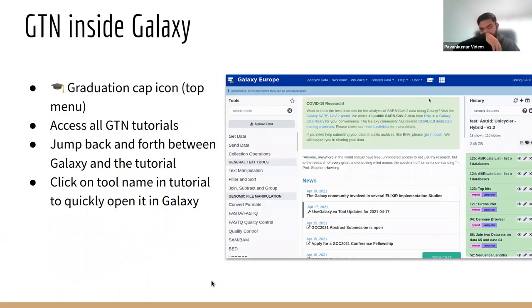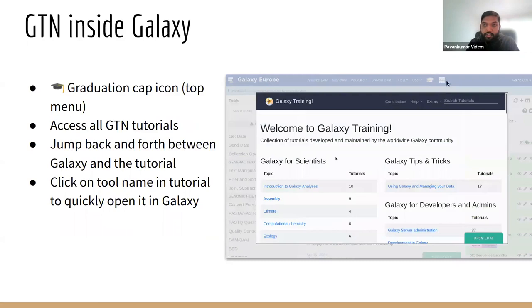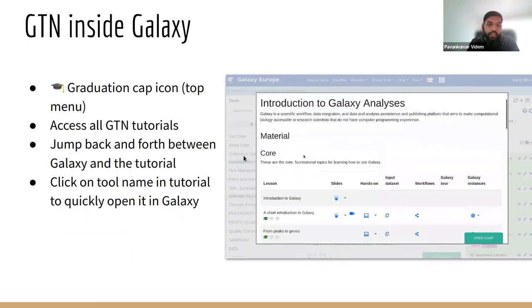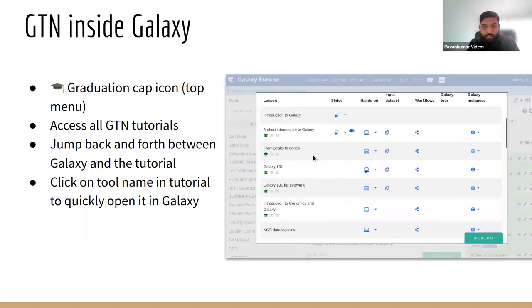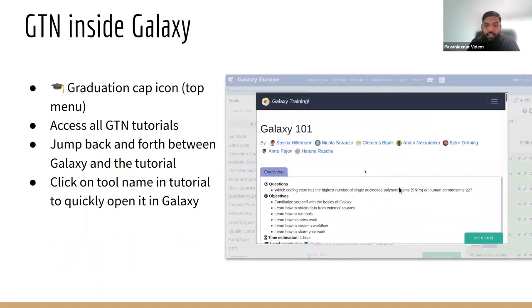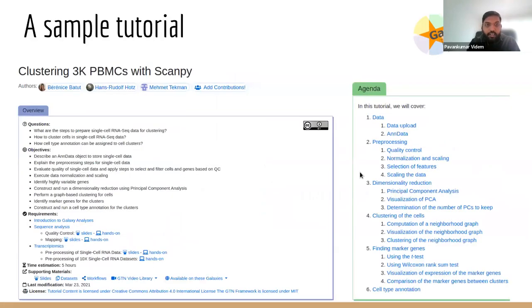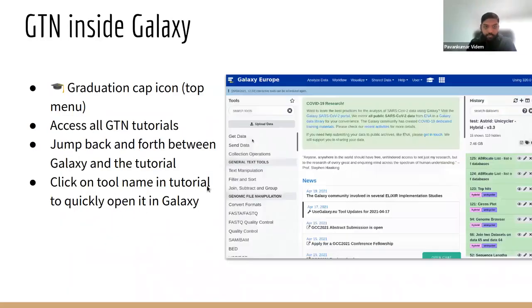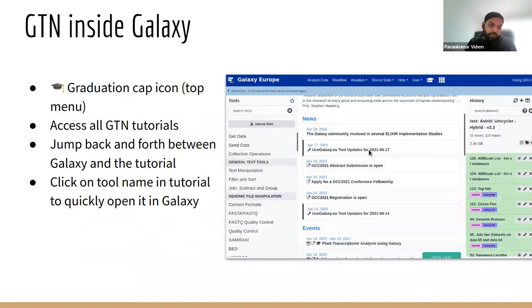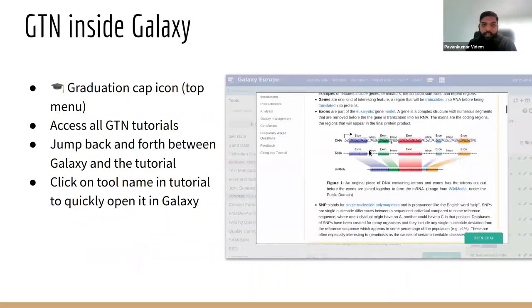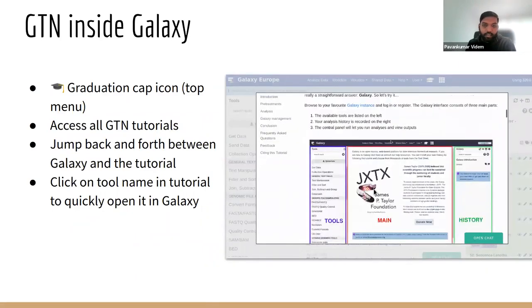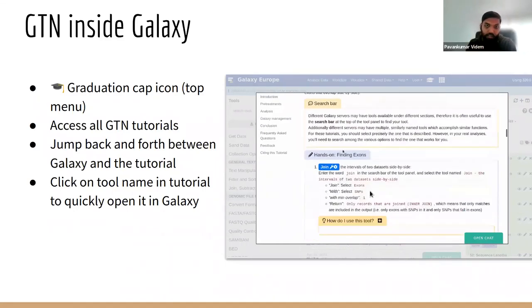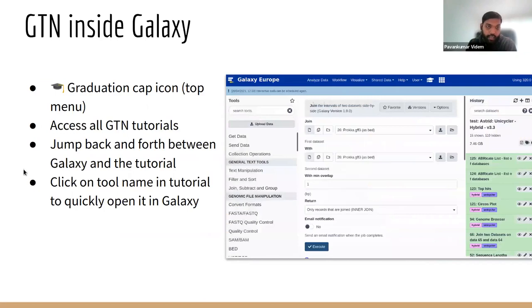Recent updates actually allow us to click on the graduation cap icon, and then you can access the whole GTN website — the Galaxy Training Network website — within Galaxy. You can go back and forth between Galaxy and the training material, and you can click on a specific tool to actually open that tool directly in Galaxy and then run your analysis.